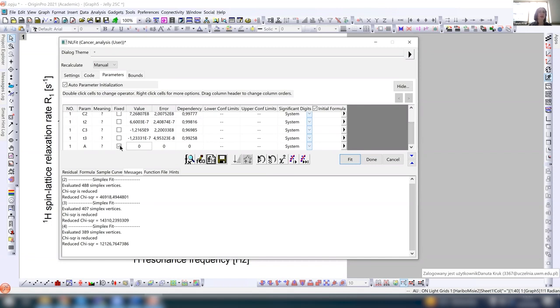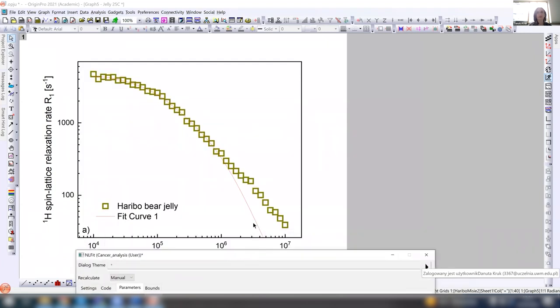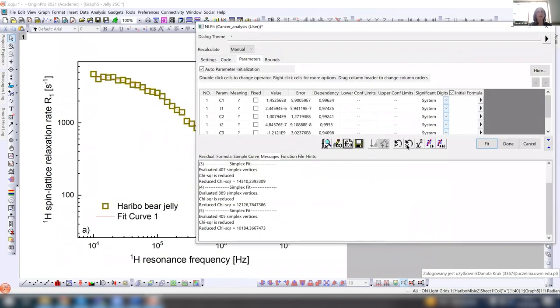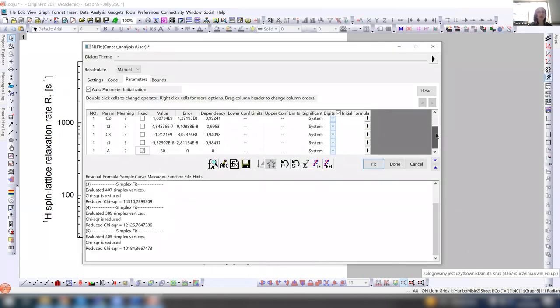Namely, I can put here like 30, because this is the last point. Definitely I have significant differences here. So if I look at the value of this last point, which is between 30 and 40, I can be sure that if I add a frequency independent term of this order, I should not get such discrepancies. So let me check what happens now. Oh, you see, I got quite a nice fit, except for the fact that those two values are negative.